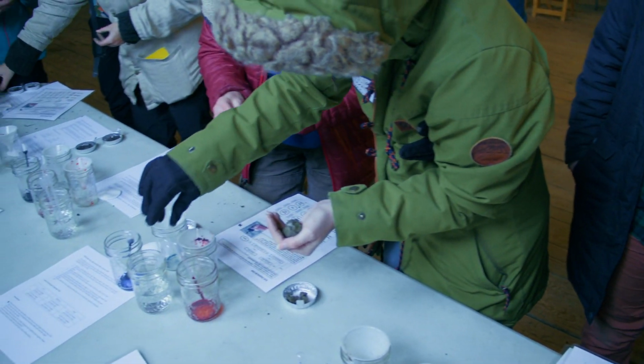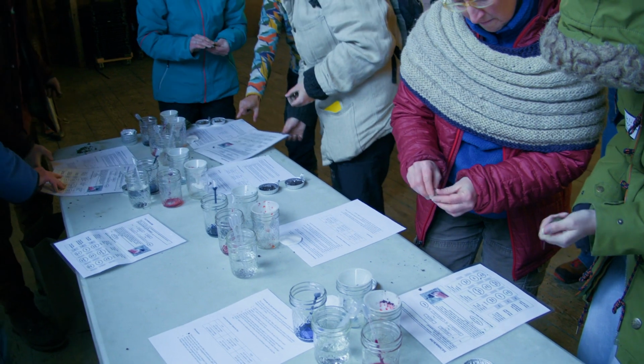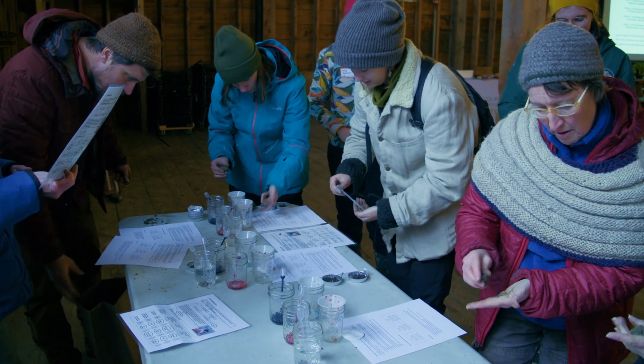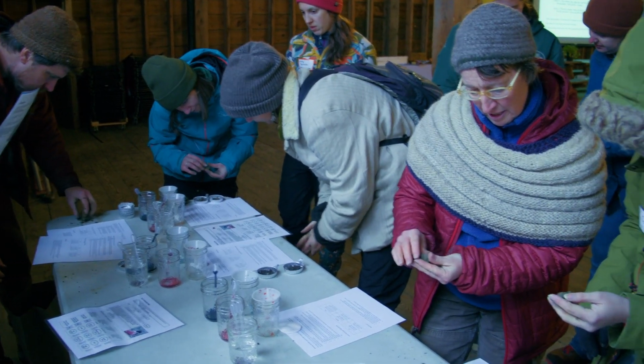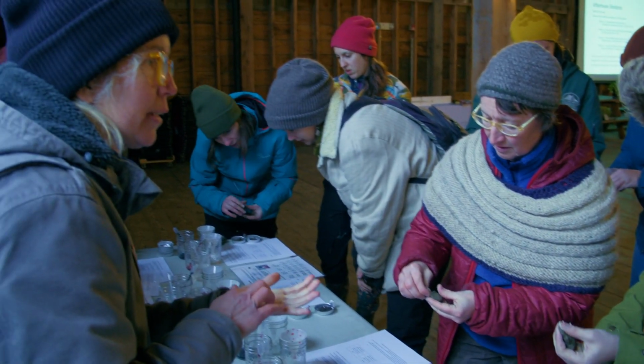That deals with cation and anion exchange capacity. So that's going to be, those instructions are on the next sheet. So moisten a pinch in the palm. Take a little bit and make it actually really wet.